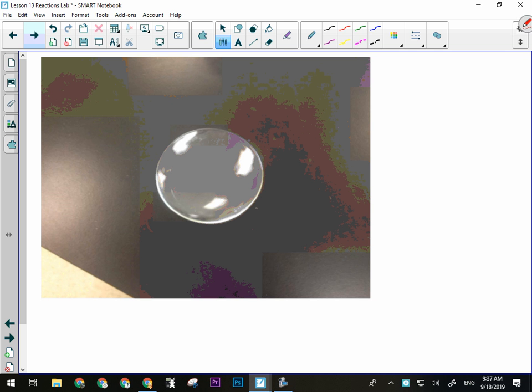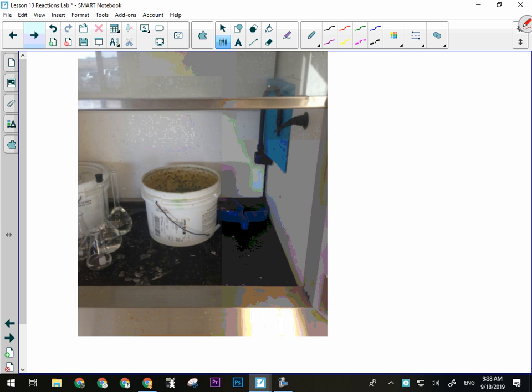Now, you want to do the mixing at your table. So put one of them in the watch glass and bring the other one over with it. You might need to fill up an eyedropper, turn it upside down, and walk over to your table, set the watch glass down, and do the mixing at your table. Should you be taking the temperature of every one of them? Yes, it says that in the instructions, so make sure you do that. This thing here, it's about this big. It's like a giant contact lens. It's not that big.